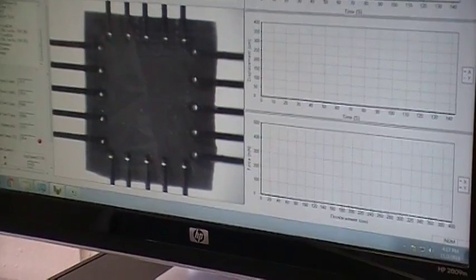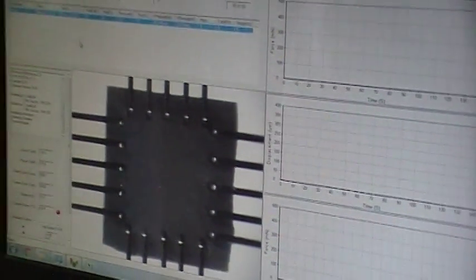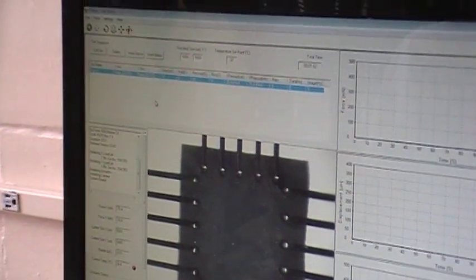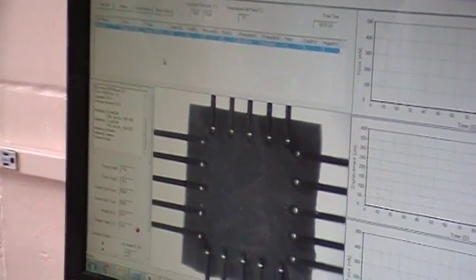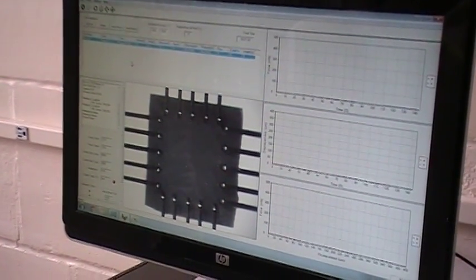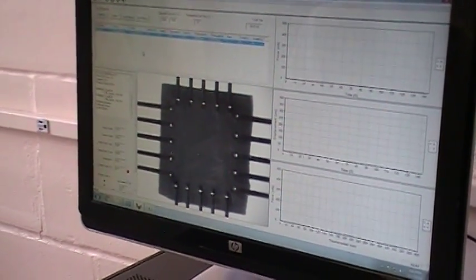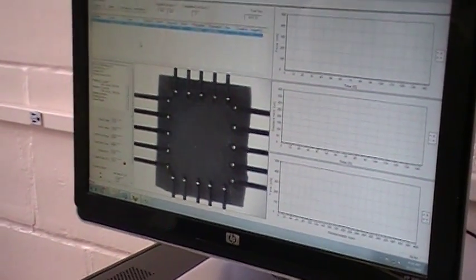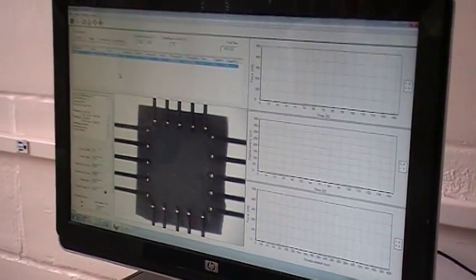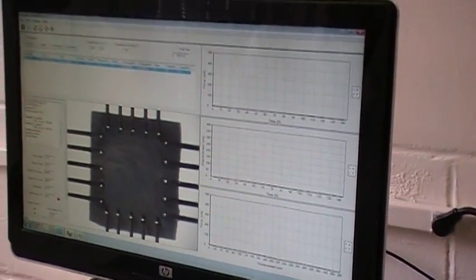The maximum you can actually do with the system is 2 hertz. 0.25 seconds for each phase is the lowest value you can achieve, simply because the actuators can only change speed every quarter second. So even when you do a true strain function or a sinusoidal function, it'll have to approximate that with a series of linear segments. So you'll hear the motor change speed as it's continuing through the test. Okay. All right, so we've got our test set up.